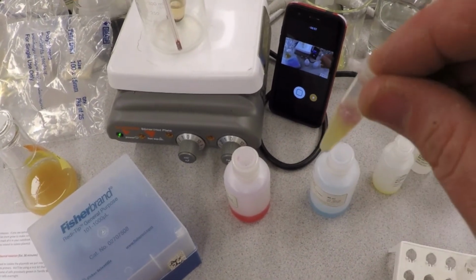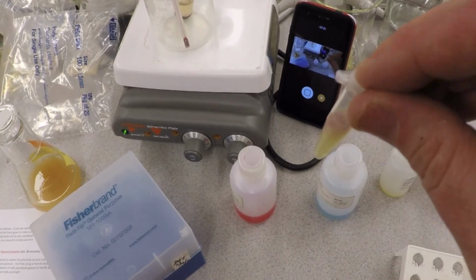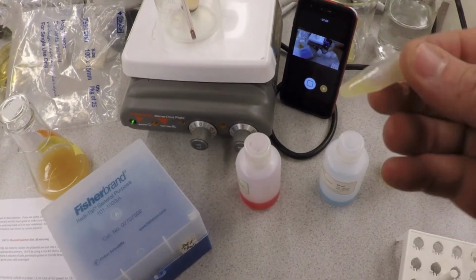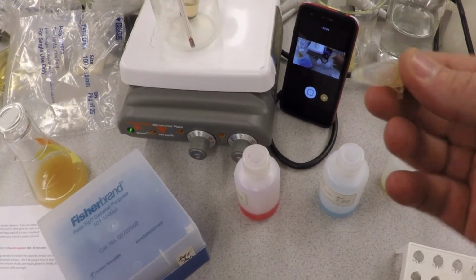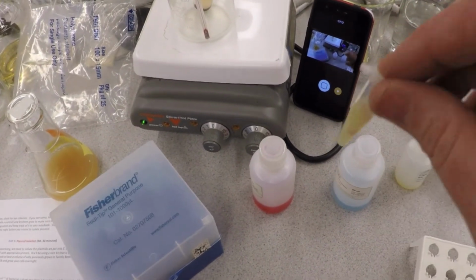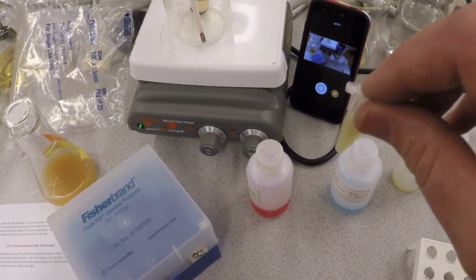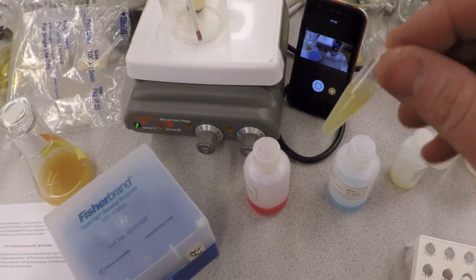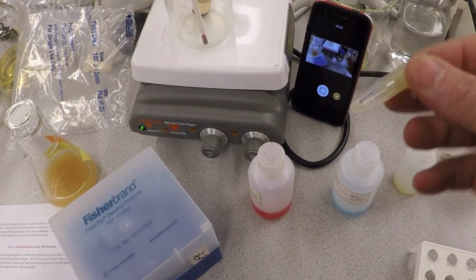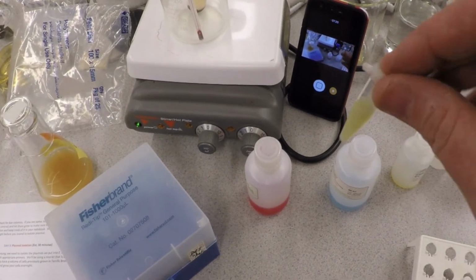until the pink is gone. Okay, so there's a pH indicator in there, and so you keep inverting this back and forth until all the pink is gone. And again, you lysed the cells previously, you got all the DNA, the plasmid and the genome, the chromosome, out, and you denatured it, so it all pulled apart, but now you're renaturing it really quickly.